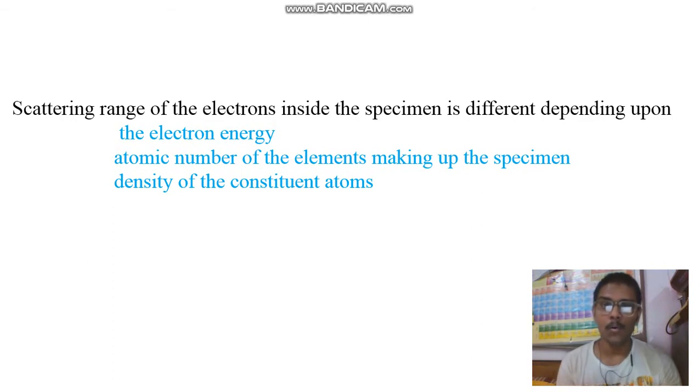But you know, old is gold. That's why, like in an old black and white picture, you will get subatomic resolution of your particles. You will get more intricate details at an atomic level. That's why SEM is a more important technique as compared to light microscopy to investigate cellular details and nanometer resolution details.